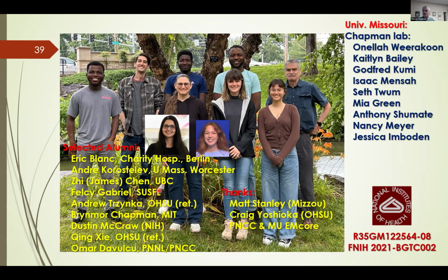And so Paul was referring to some reciprocal space methods of doing that. We're able to do it because we can refine the occupancies and B factors in real space, and we can subtract that density from our map in real space.